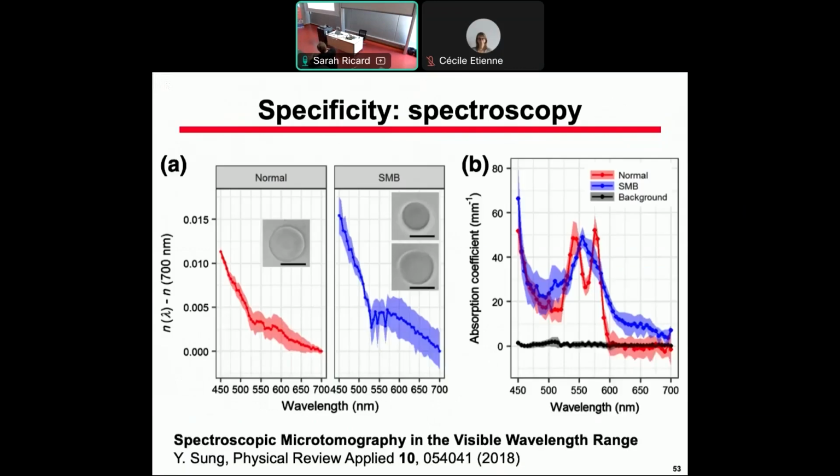First, as I've shown, you have the index of refraction, which is index and absorption. In terms of variations of index of refraction over the spectrum, it's not so important. N is a function of the wavelength, but the absorption often is very important. And here you have a so-called spectral experiment, doing tomography while varying the wavelength with a white light laser.